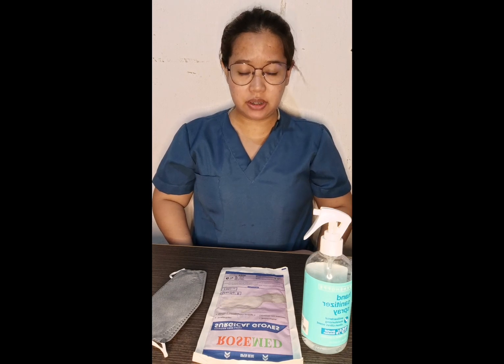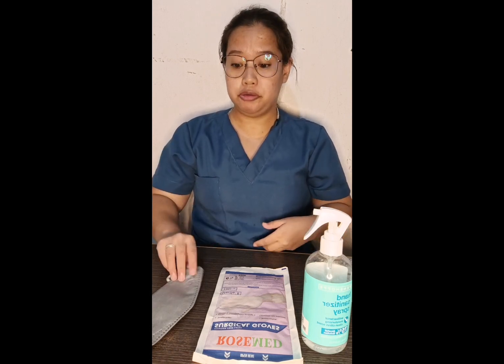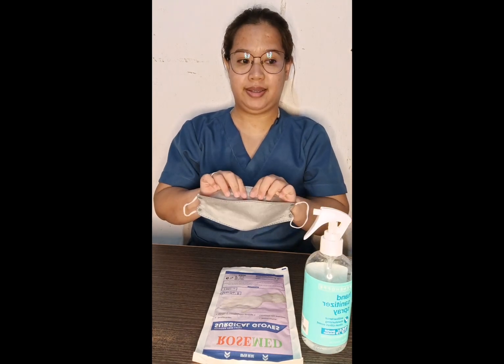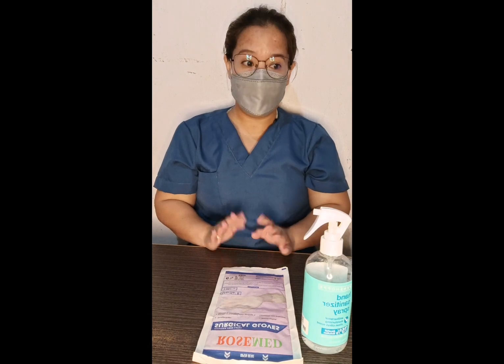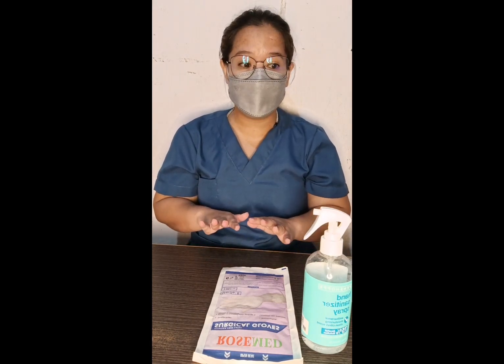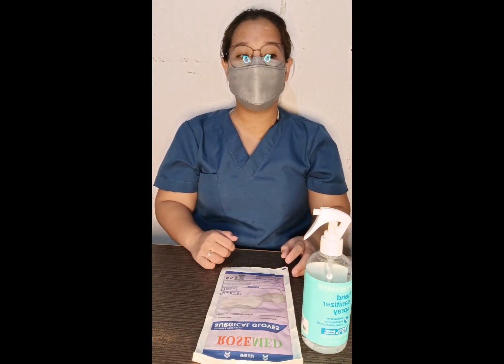Today I will be demonstrating to you how to put on and remove surgical gloves. Wear a mask if you are instructed to use one. In our case, we'll be using our surgical mask. We need to wash our hands before and after any sterile procedure. Prepare a clean work area each time you use this technique.